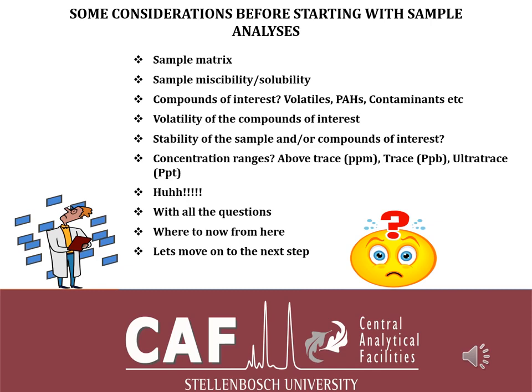When you work at trace in the ppb level and ultra trace, you can start treating them similarly, because you might have to do injection in single ion mode, which we're going to talk about later, or you can use MRM, sometimes called SRM. We'll talk about that later when we go into the instrumentation part.